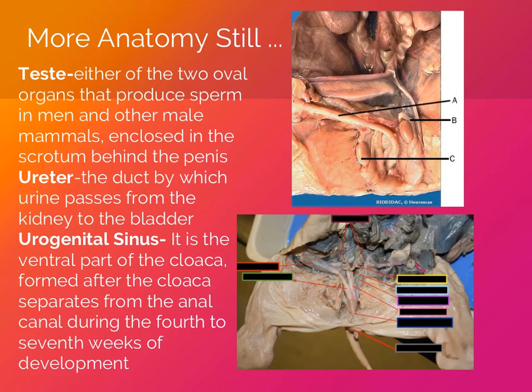So that's about it. Oh, the ureters. The ureters are going to come off of the kidneys. Here's a kidney here. I don't have a really good picture of the ureters that I can see, but the job of the ureter is to take urine from the kidneys down into the bladder where it's stored, and then it'll exit the body through the urethra, whether it's male or female.